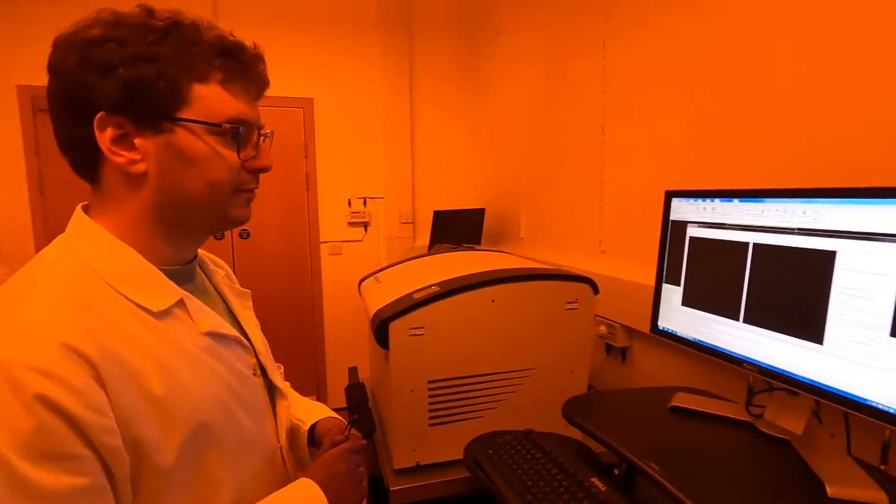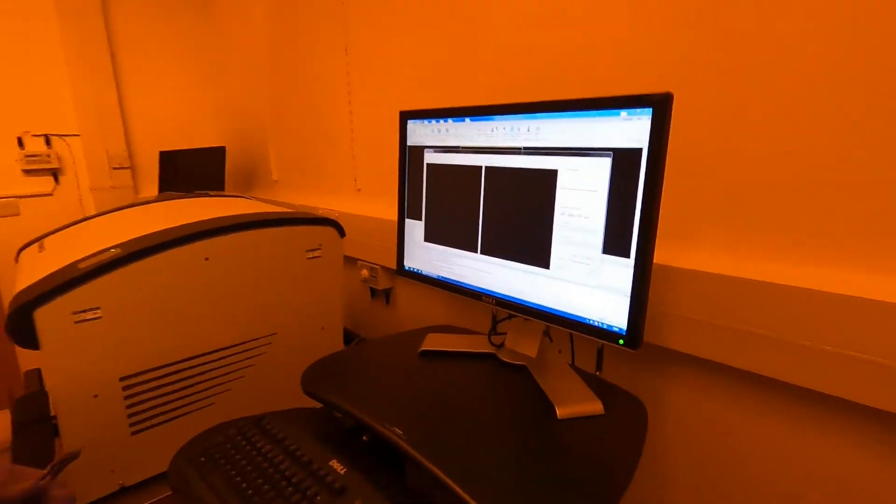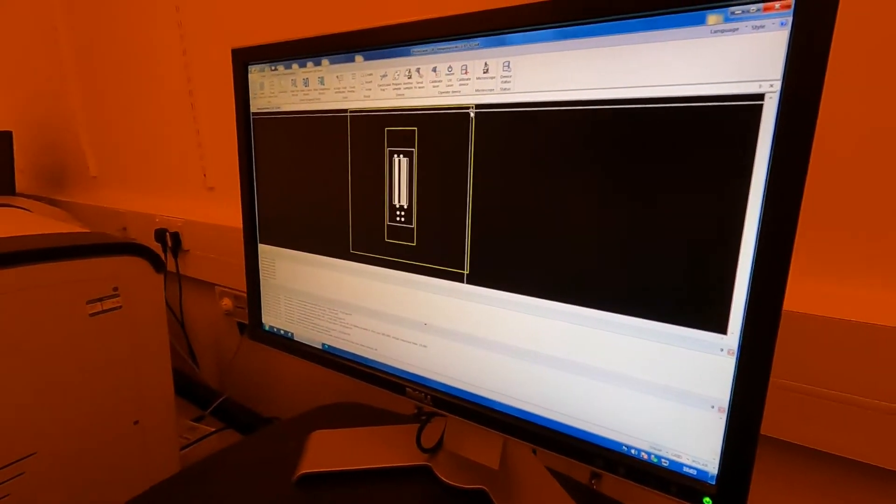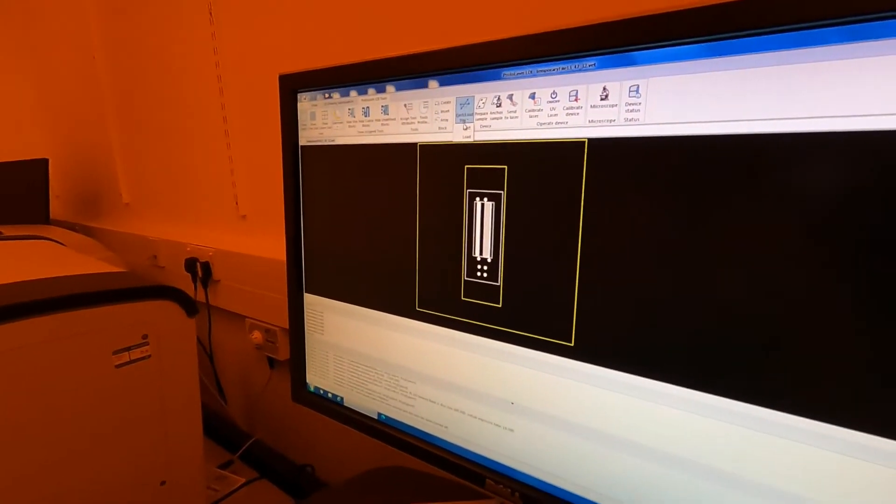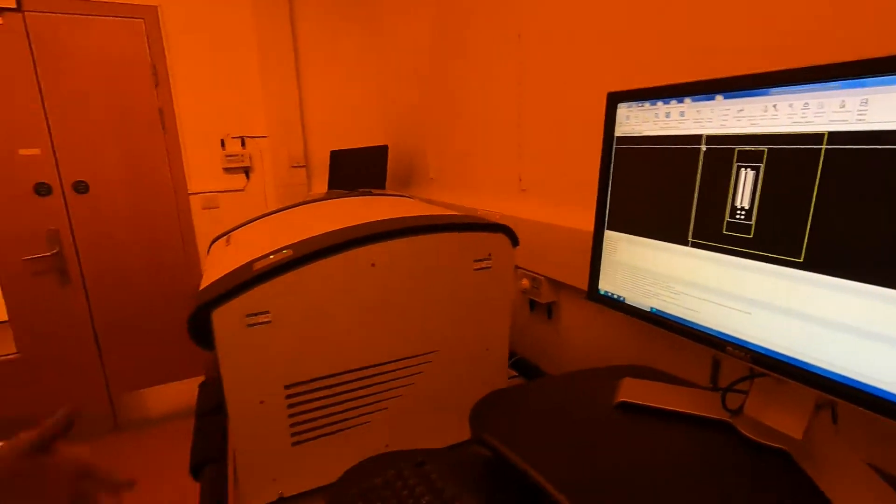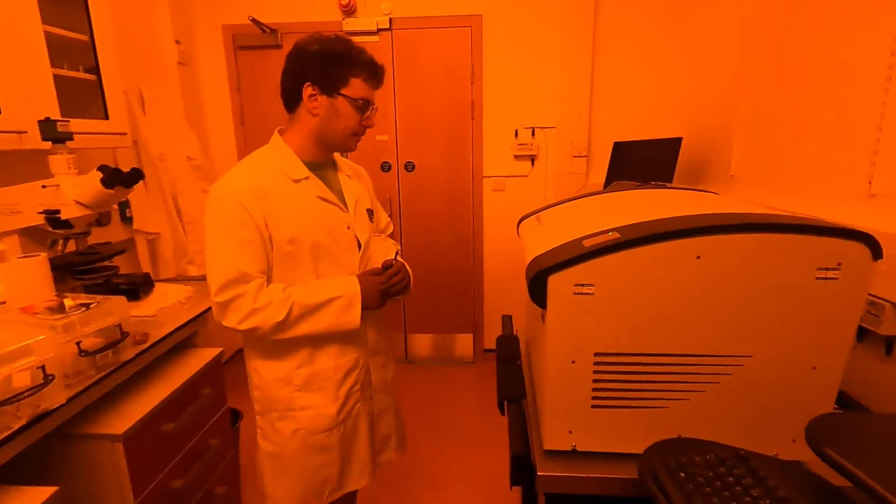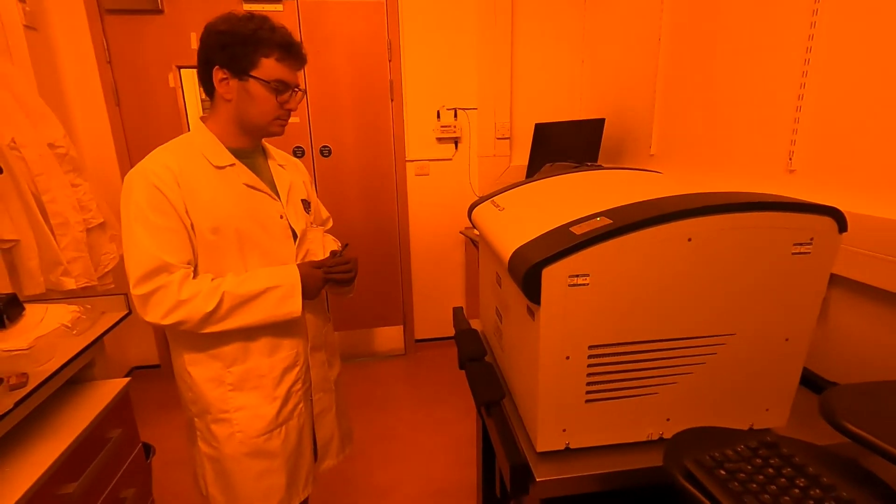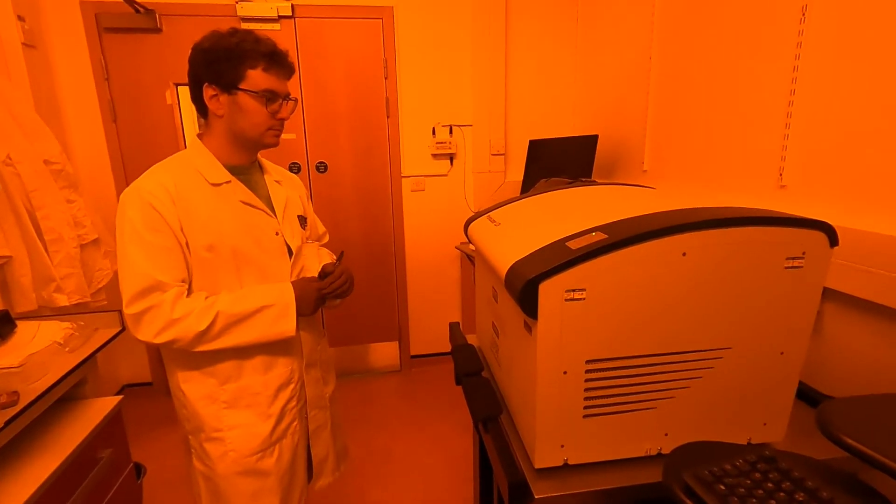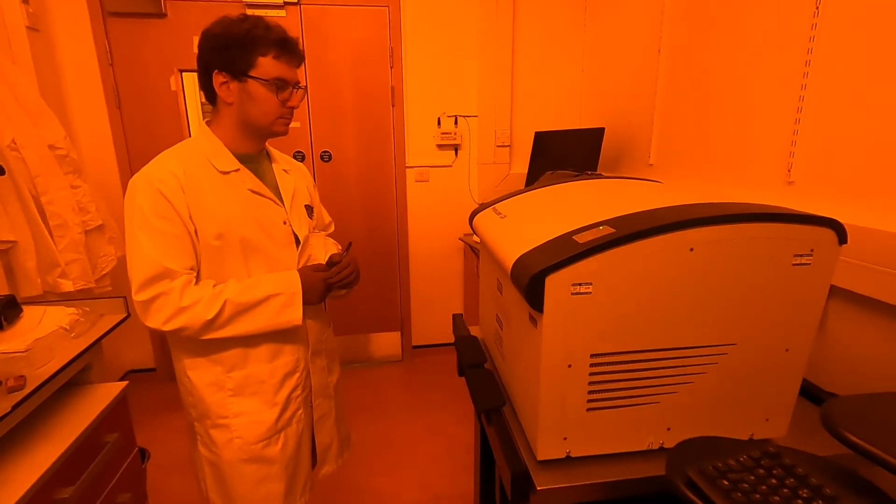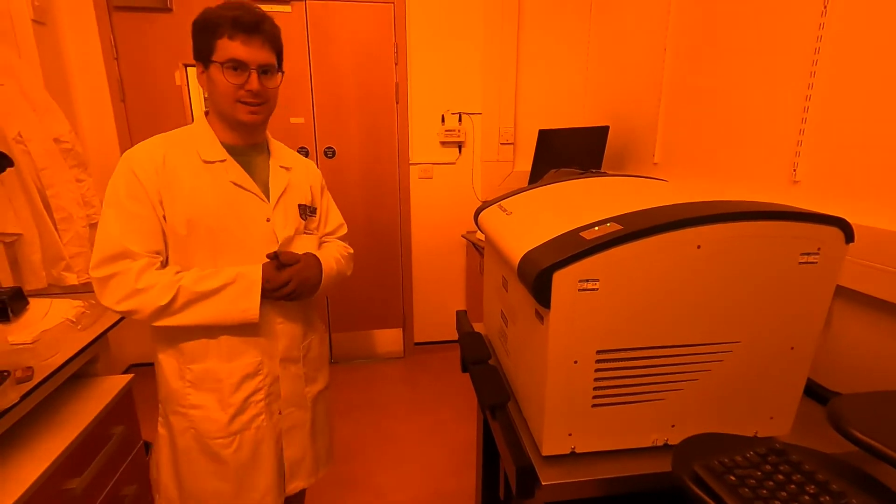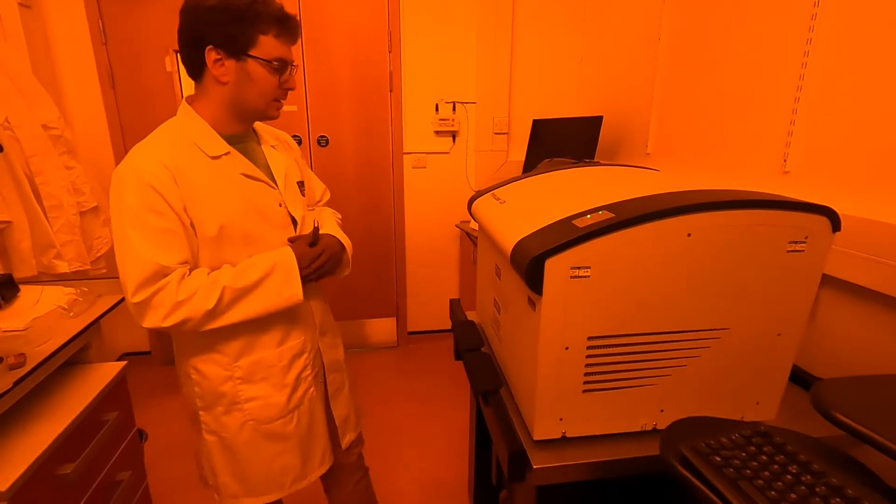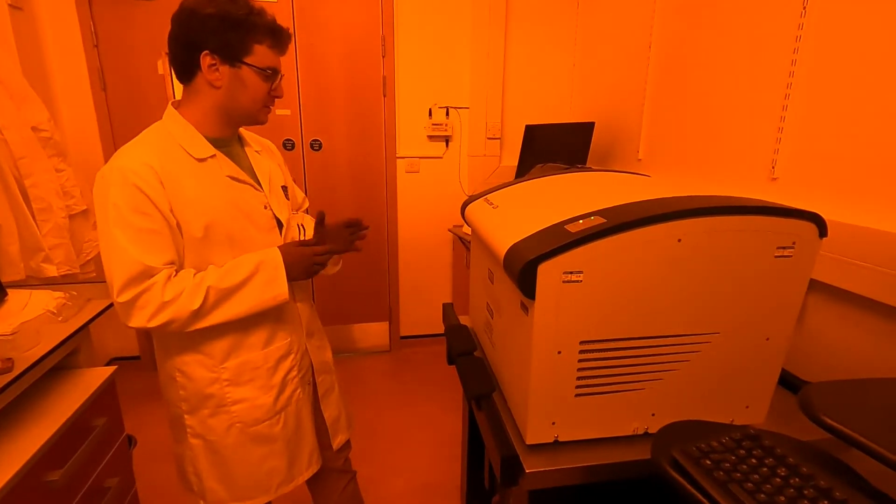The sample has finished exposing, so we can now close the interface and eject the sample. As before, we need to wait for it to eject. This can take half a minute to a minute depending on how the machine is doing.